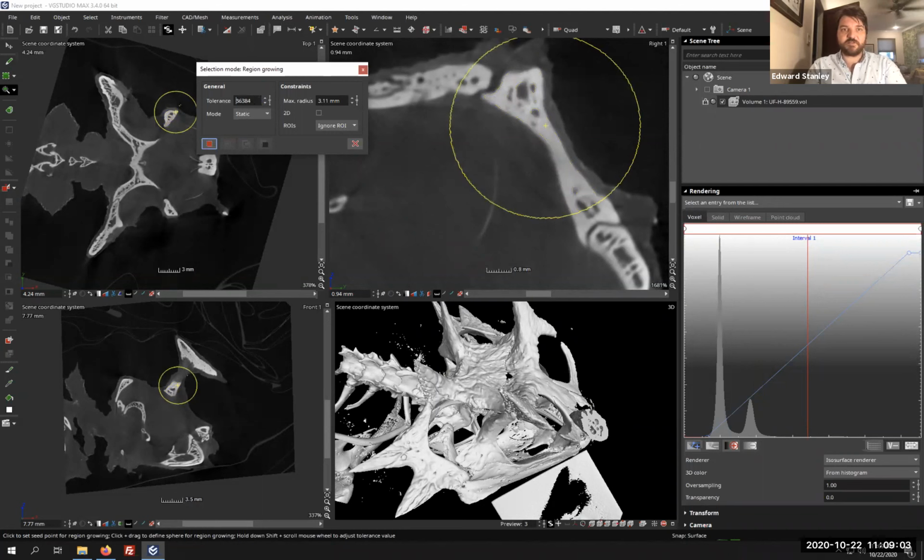3,000, it's going to select everything, right? If we go to 2,000, maybe it'll start selecting. It'll avoid some of the lower density parts, but it's going to grow out everything. So you can play around with these gray values here until you get to the part that you want. So say at 16,000, that tolerance can jump across that gap, but at 6,000, it can't.